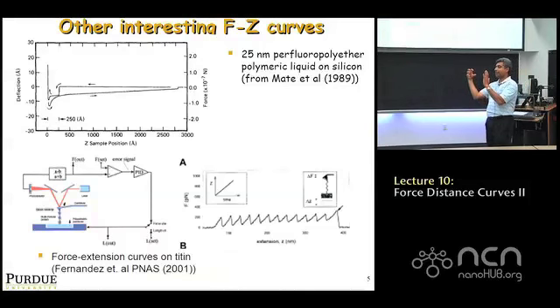So what ends up happening is, first, the tip of the cantilever approaches the sample, and you've got a very thick layer of liquid, and at a certain critical distance, the liquid just wicks up, forming a meniscus, really causing an instant negative force. As it's trying to, surface tension tries to pull the cantilever down. That's the first jump down you get as you approach the sample, right? You see that? So that's this one. That's the first snap in, if you will, that occurs. It's because the liquid just wicks up and sucks.